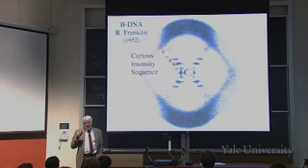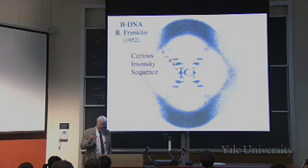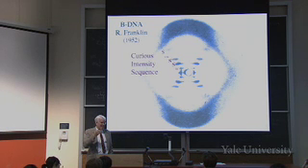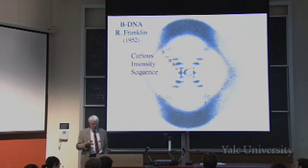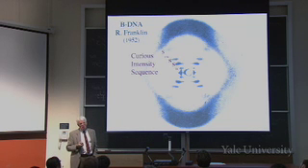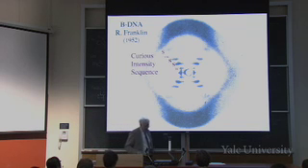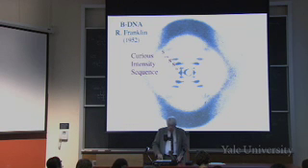The intensity doesn't just evenly decrease as you go out. Instead of being strong, not quite as strong, less strong, weaker, very weak as you go out, it goes weak, strong, strong, very weak, strong. Now, why is that? Why do you get such a funny pattern of intensities? Let's look at this again.